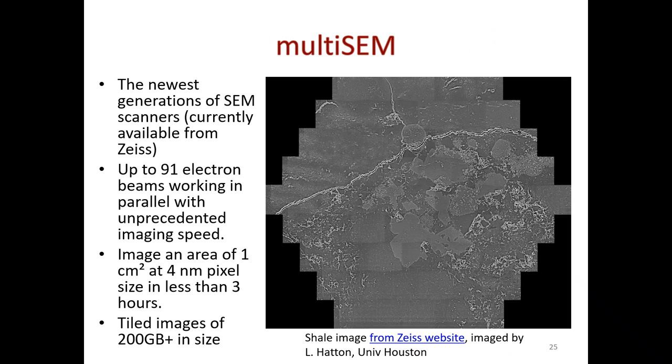In my lab, Dr. Chris Landry does the same, but he basically moves the SEM over a larger area and assembles a tiled image as well, with one beam. And there is software that stitches those images together, such as here. You can see the lines here somewhere. So the problem with these images is, A, they're large. This can be 200 gigabytes in size.